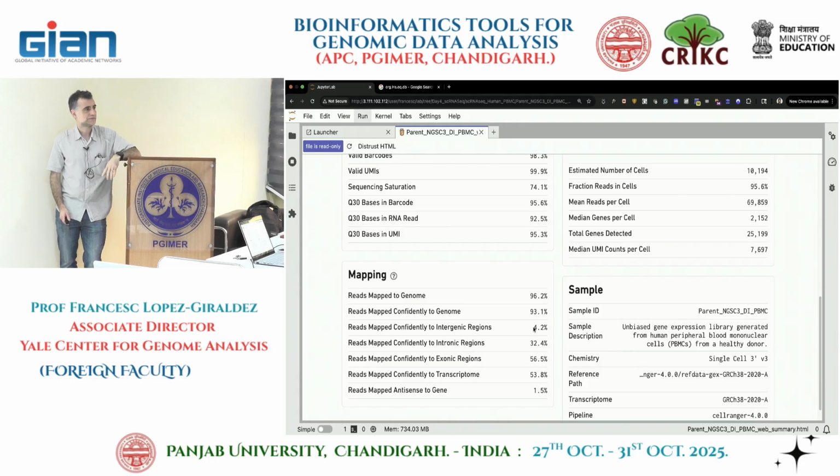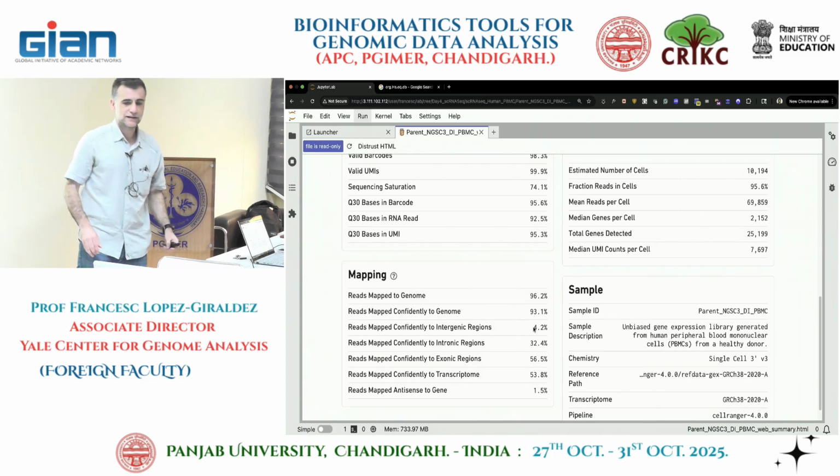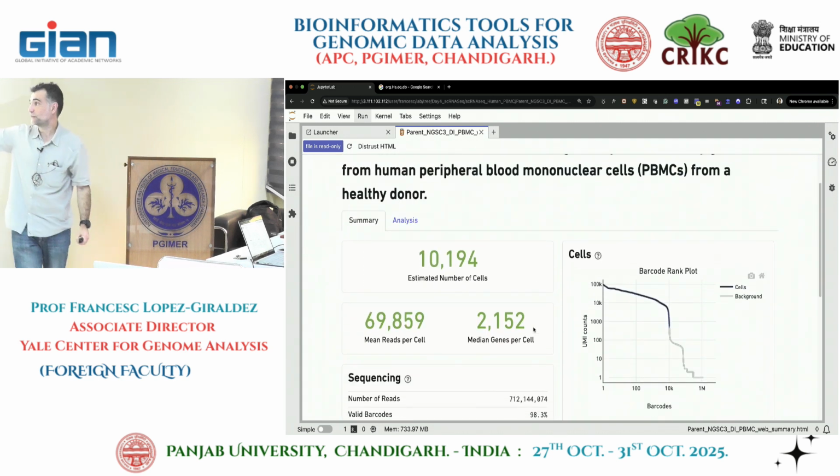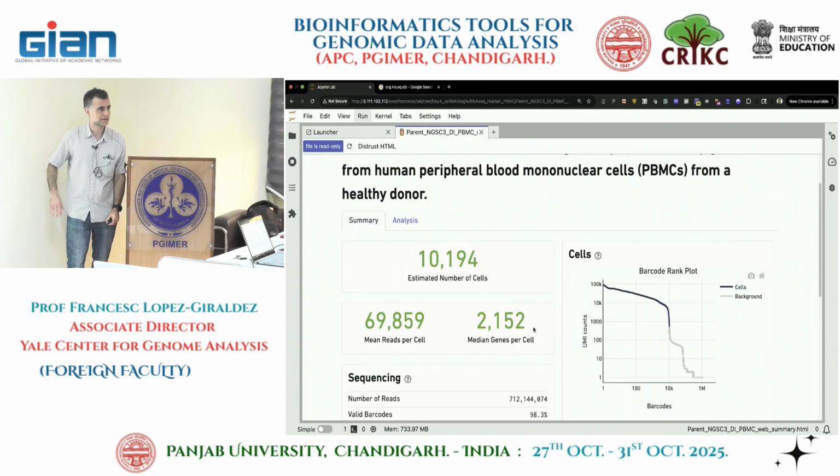So are these the parameters which we need to check whenever we are running the single cell RNA sequencing and we are getting the data? Yep. So they already, I mean, they know how to tell you, right? I mean, how to give you the data. The big three numbers, check them, right? To be sure that your expectations are met. That's the first thing. Then you can check all the type of data down there. You can be sure that they even build saturation curves now, I think, in the new reports. How much saturation you get. Are you expecting to see more genes if you keep sequencing?